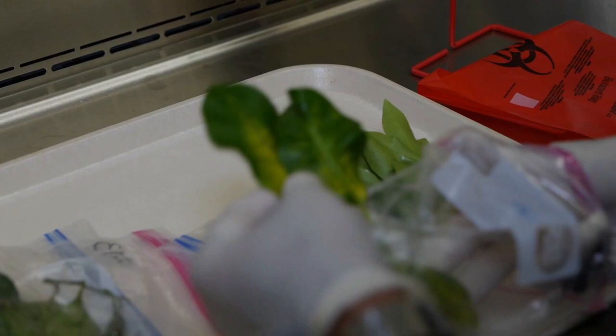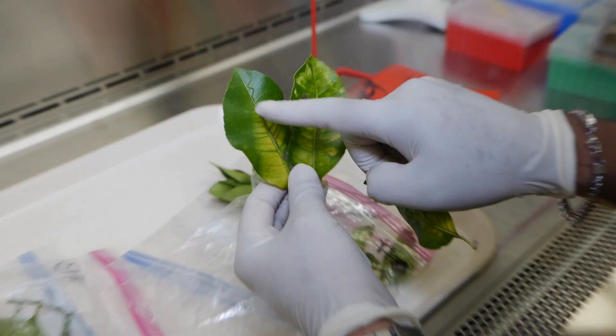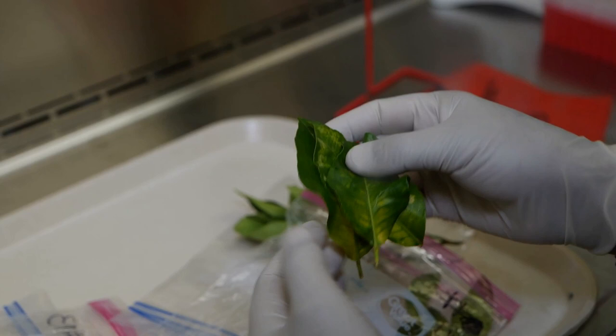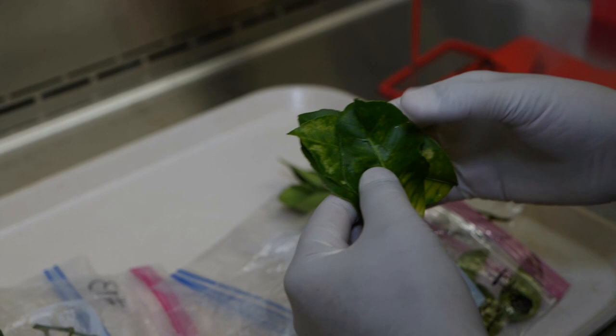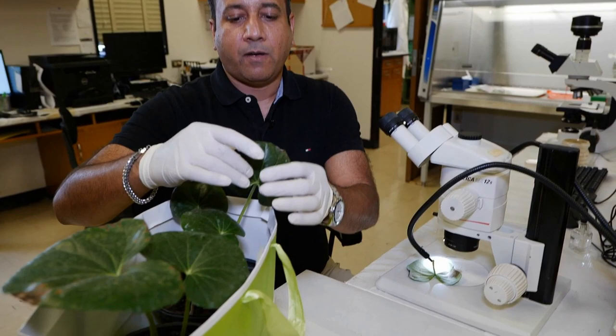But at the same time, this blotchy mottling can easily be caused by a nutrition deficiency or something like that. You can see there is some similarity in these two different leaves - they have similar kind of symptoms, so we definitely need to test it. For this testing we have to take the midrib samples out. We either do the DNA extraction and then we will run that with specific reagents that will only amplify the citrus greening DNA if it's there.